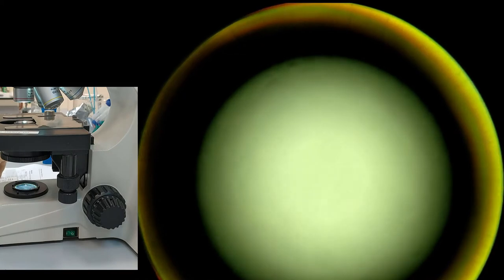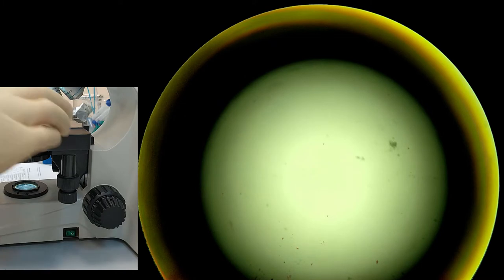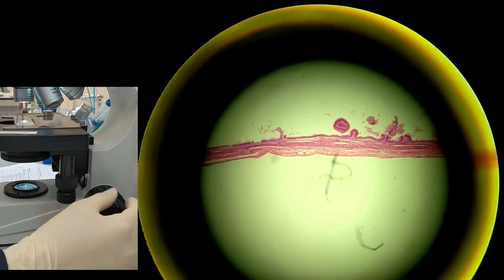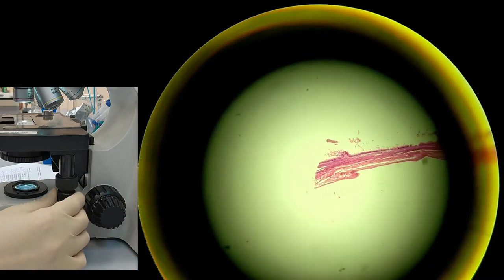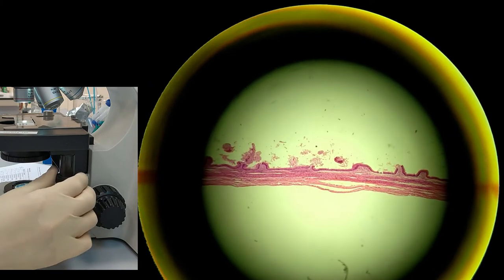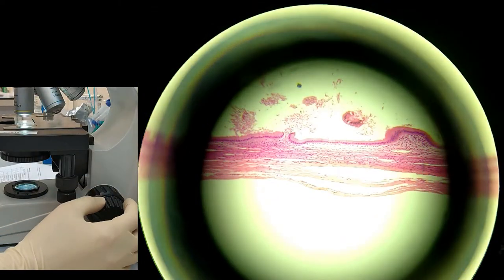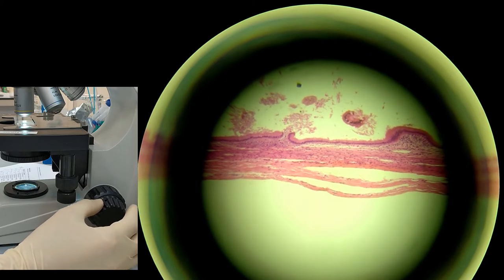Switch to 4x again and take the third slide, which is simple columnar epithelium. Here you can see it with no much details. This is epithelial tissue that makes up the columns. Switch to 10x, then switch to 40x.